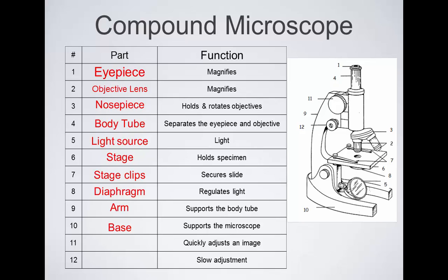So, for example, on this microscope, if I move this knob, what happens? It raises it. Yeah, the stage moves up and down. And once the stage gets to the proper level, what you're looking at would be in focus. Okay? So those knobs are used for that.